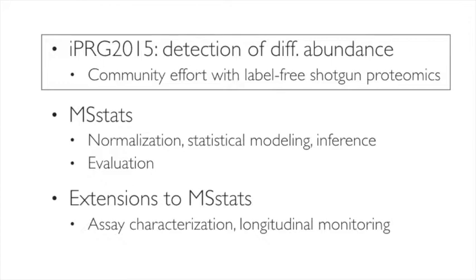We will talk about MSstats, and this is the software which we developed. Meena and Sung-Heng are the main people involved in this effort to work specifically with quantitative mass spectrometry-based experiments. And then we'll talk about some of the methods which extend MSstats.